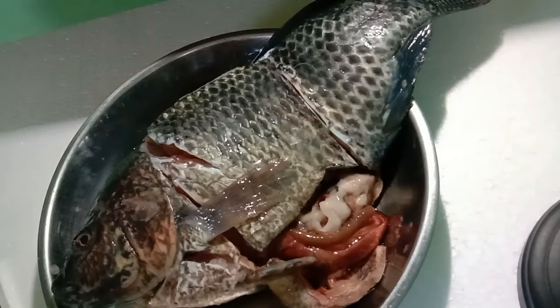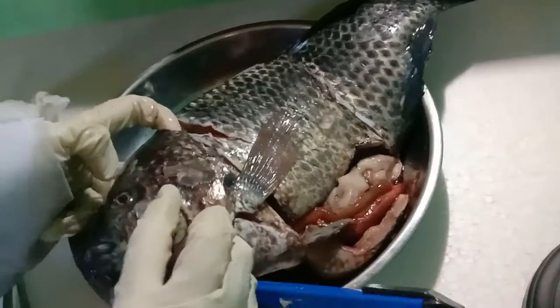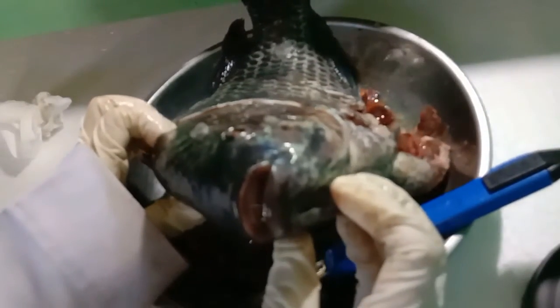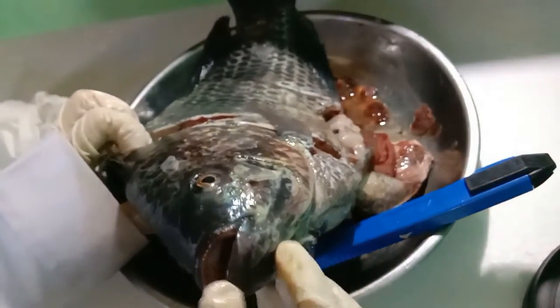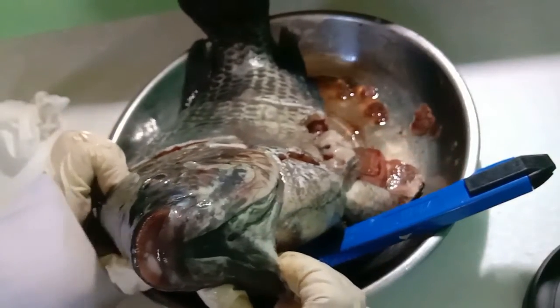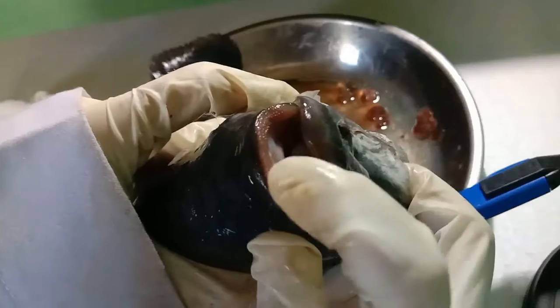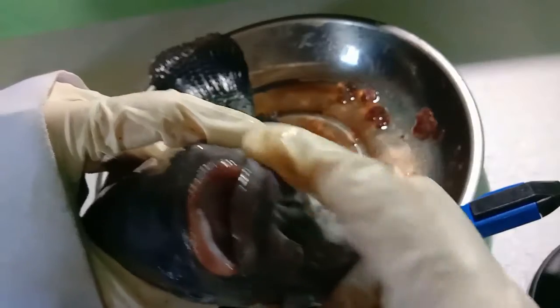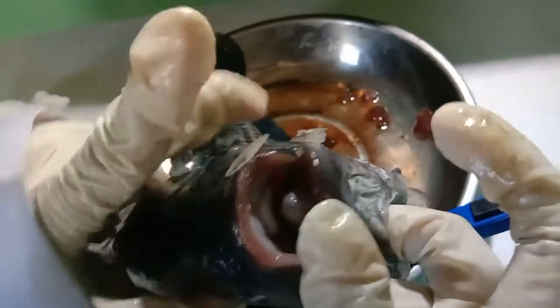Okay, the third discussion is about the digestive system. It starts from the head. This is the mouth. There are teeth and a tongue in the mouth. You can see the teeth are quite sharp, and the tongue here, you can see, is the tongue.